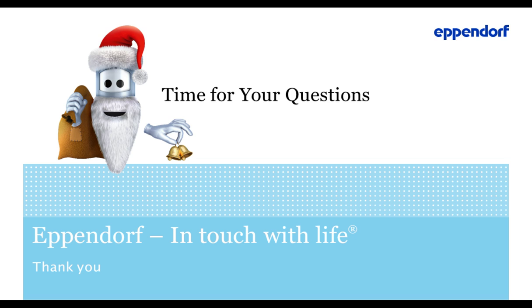Give me a second, because this question is not answered that easily, because this really depends on the sensor type you're working with. Let me start with the DO sensor. For example, if you're working with an ISM or an analog sensor, you need to do at least 4 hours of polarization prior to the calibration. So you have already 4 hours of waiting time here, which is perfect for the inoculum preparation.